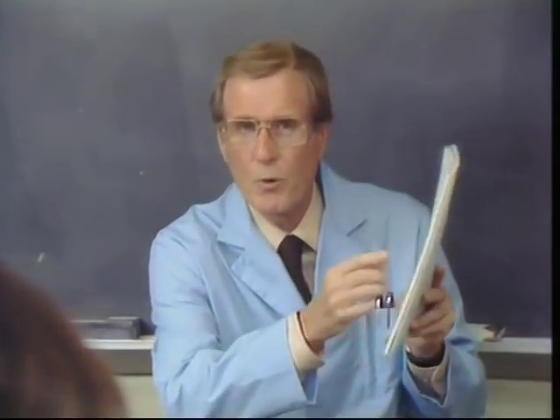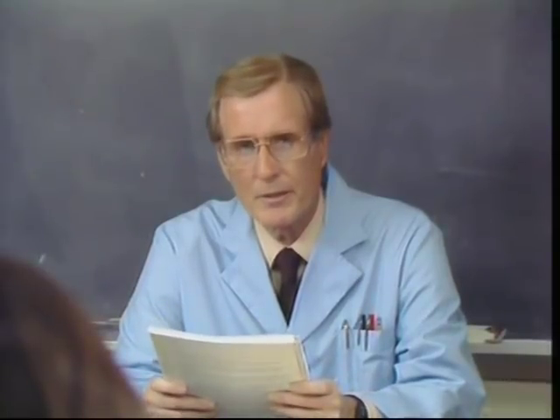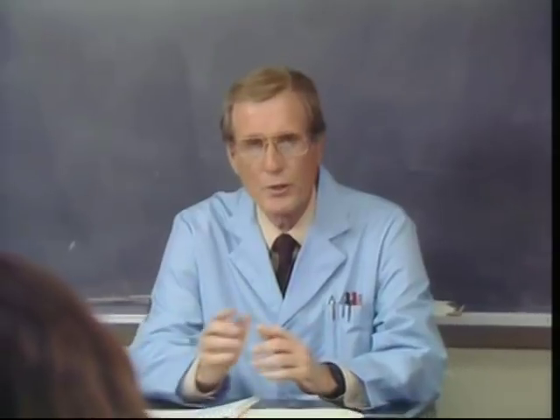Before you start any experiment, read the complete set of lab instructions carefully. Most safety procedures and warnings are clearly indicated there. If after reading the lab instructions you're uncertain about what you're being required to do, ask your lab instructor. Never carry out any experiment without knowing what you're doing.